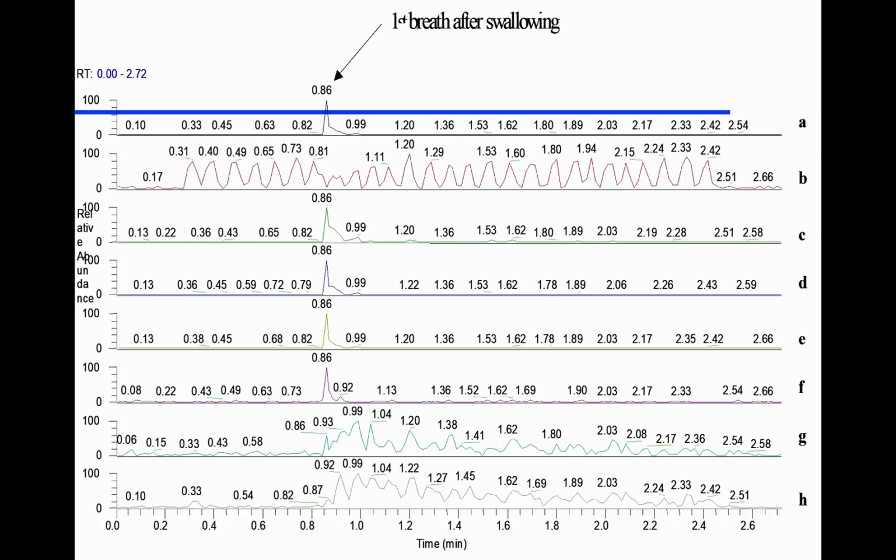And so they're measuring acetone in your breath, so we can monitor breathing. This is what we call a swallow breath. At that point, that's the highest dose that your receptors are given. And so all of these compounds were given off to some extent. But some lasted almost no time. By the second or third breath, they were gone. Some compounds got stronger as it sat in your mouth and you processed this longer and longer.